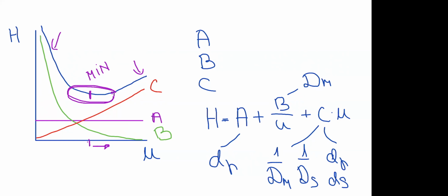And actually, the big question in the production of chromatographic columns is how to obtain columns which have as minimal plate heights as possible, and also which have plate height profiles against the mobile phase flow rate with this nice plateau minimum here. So for which the optimal flow rate range is quite wide. So these are important questions in developing chromatographic columns.